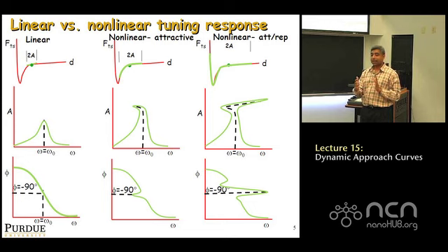To see this, you have to engage the surface and then jog it by 100 nanometers, or keep it there and sweep the frequency. This is not something that most AFMs do. You have to send an email to the manufacturer, tell them, I want to do this, and they'll say, well, disable this or enable that, and then you can do it. It's a special function.